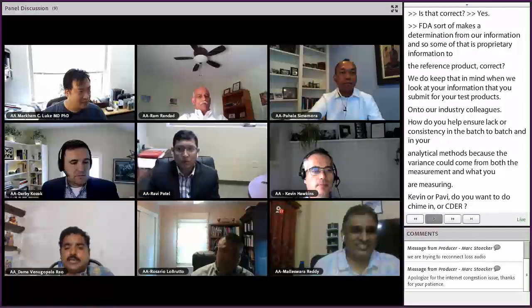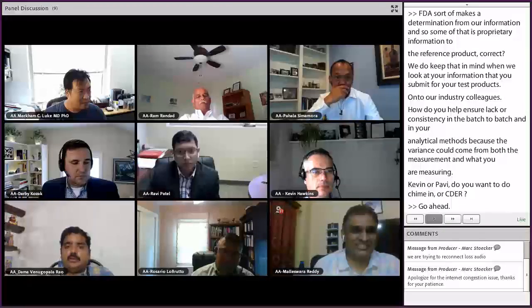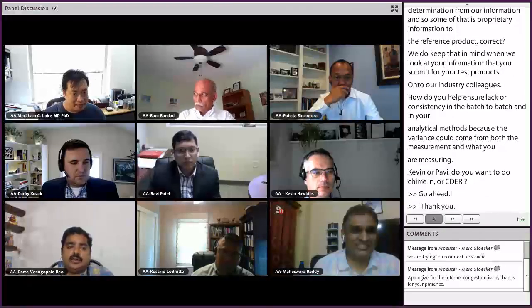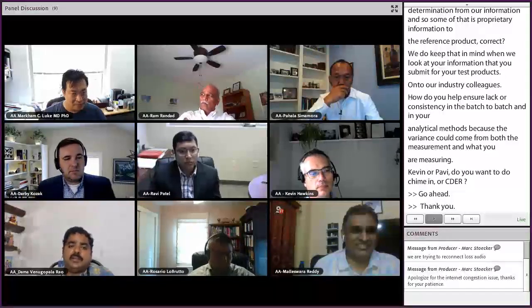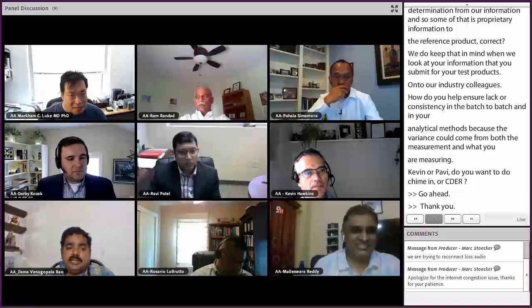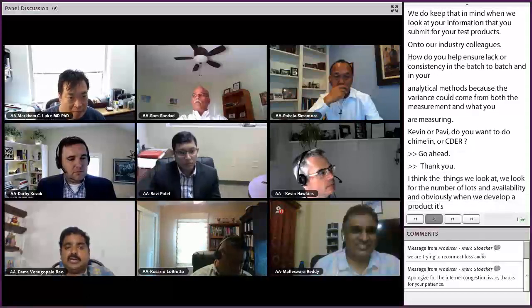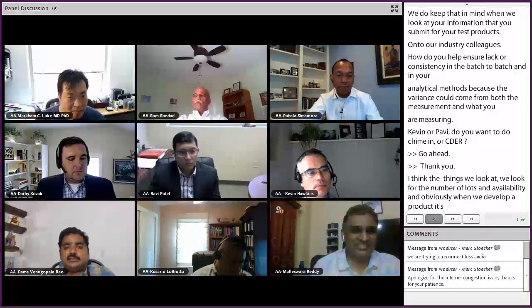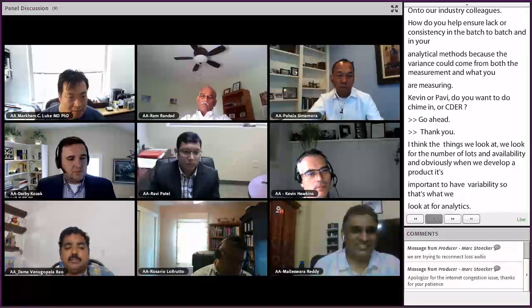Thank you. So, as Pahala rightly mentioned, the first thing we look at is as many RLD lots as possible to understand the variability, and we consider that when we develop any method for Q3 or Q2. It is important to keep the analytical variability as minimal as possible. That is what we look at for any analytical method. This is the first aspect: look at most of the RLD lots, see what range we get, and first ensure that the test product data fall within that range with the analytical variability.